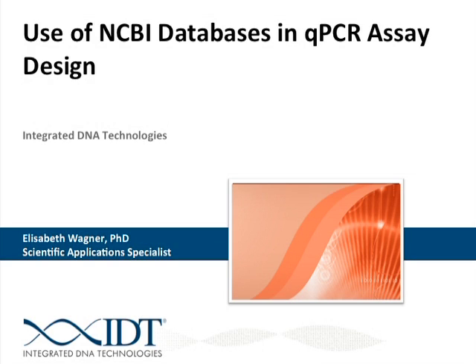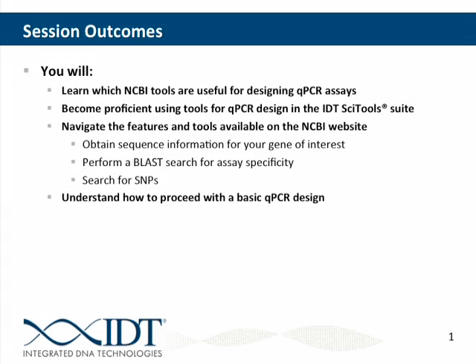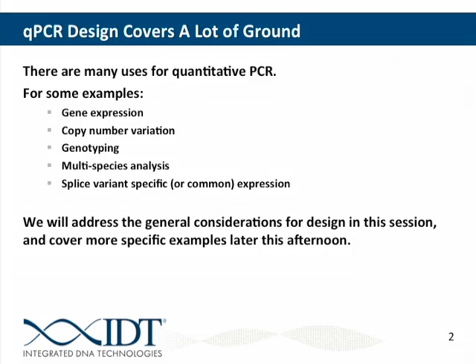And so we're going to touch on more of the specifics of how to tailor these different applications later on this afternoon. But this morning we're going to focus mostly on using these databases for optimizing a basic qPCR reaction.